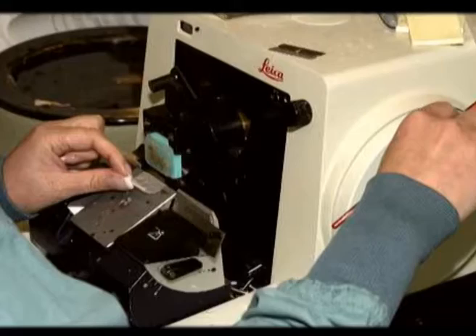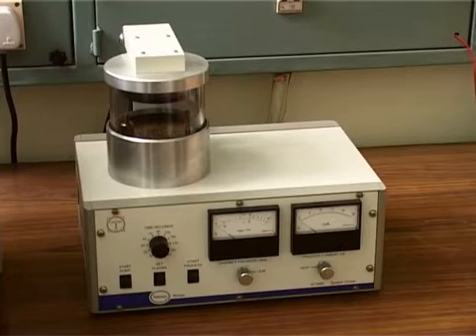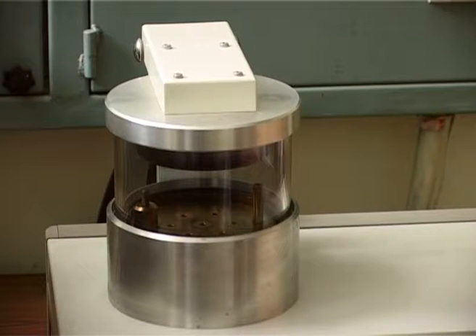This hard sample can be taken to a microtome to cut very thin or ultra sections. Once the sections are cut, they are taken on a copper grid and again stained with heavy metals and then taken to the TEM facility for imaging.